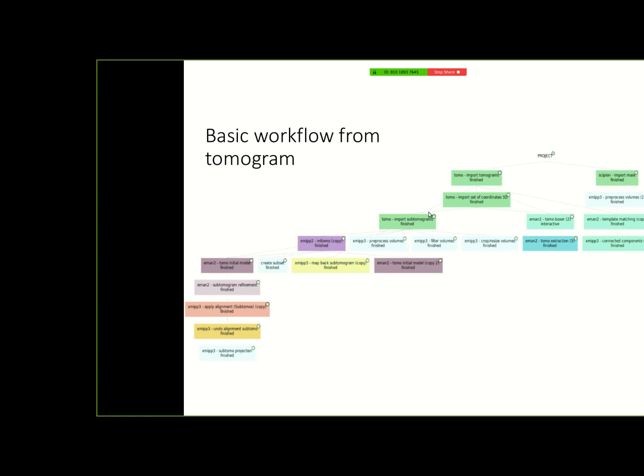So the concept in Scipion is that the output of one step is the input of the next one, and the protocol in Scipion will take care of the needed conversion. So let's say that you have to change the orientation of some particles to get into the next program, so the plugin will do that for you, and the same at the output. So at the output we understand the convention of the program, and then we convert it back to the convention of Scipion, so that in that way we guarantee the compatibility and the interoperability between different programs.